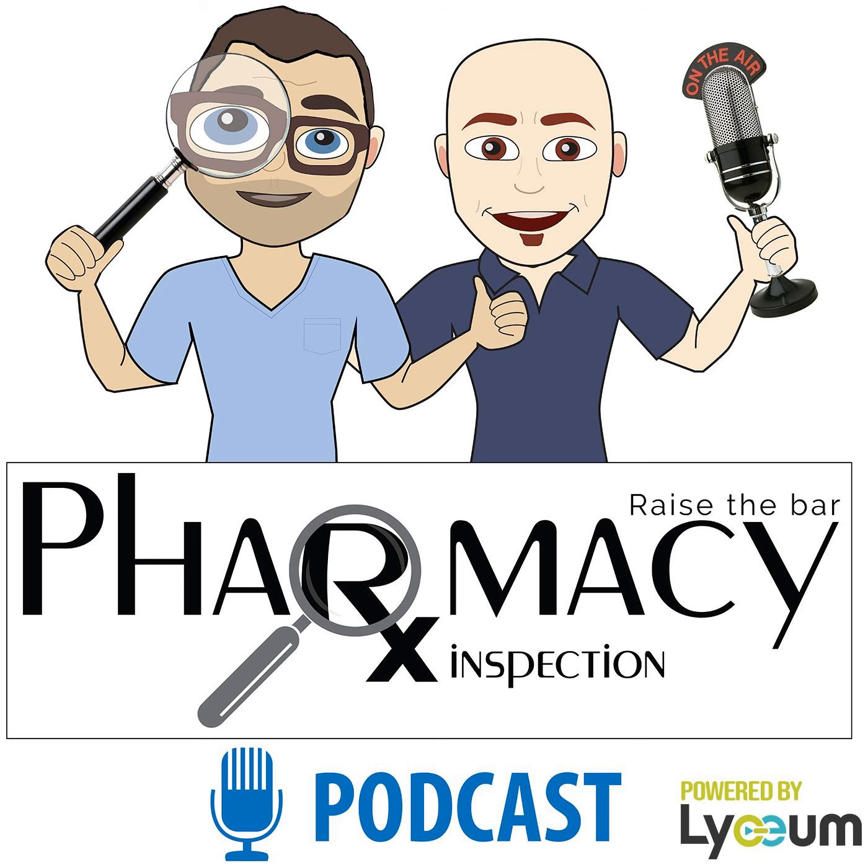Again, let's continue to just focus on the ISO 5 location, as this is the most critical part of the clean room, as this is where compounding is performed. In either case, April and October, an investigation should have been done in the clean room to figure out what the underlying issue is. I encourage you to go back and listen to the podcast episode on investigations and CAPAs for learning how to properly investigate and document microbial excursions.